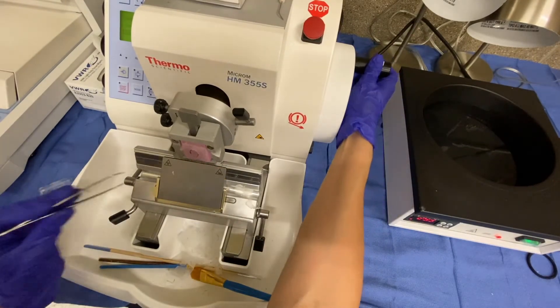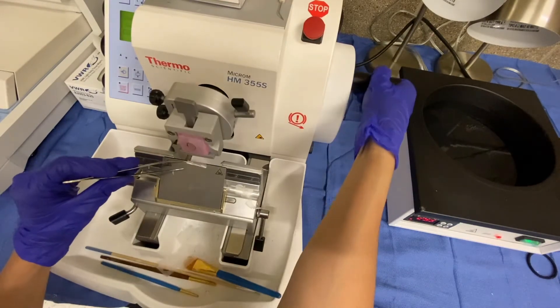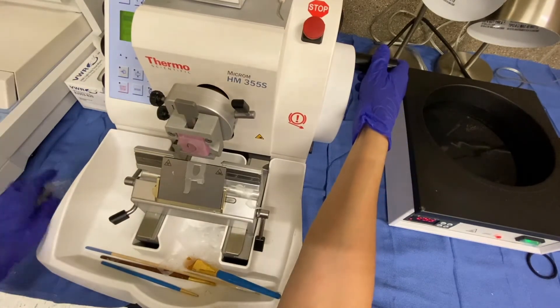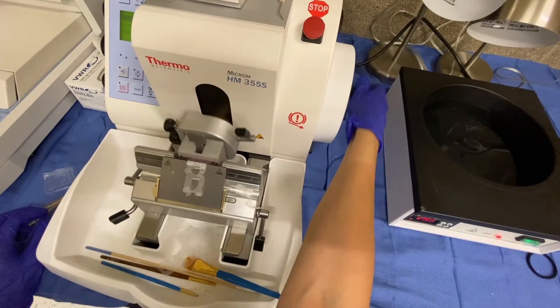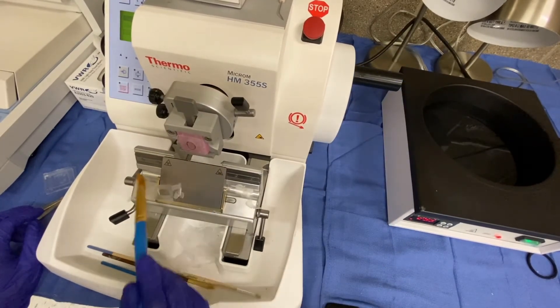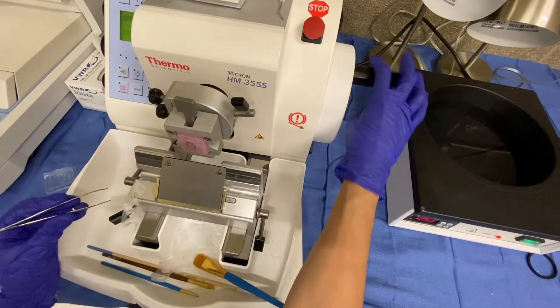I believe I'm at a point now where I'm going to switch over to feed, which is the four micron setting. You want to take a couple of rotations at that setting to kind of smooth everything out. Now I'm going to wipe away the old paraffin ribbons. Hopefully I can get a good ribbon for you.